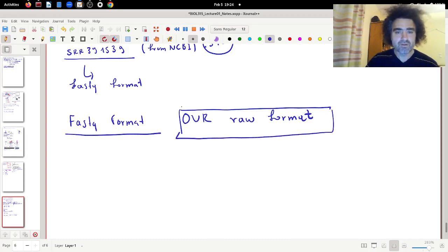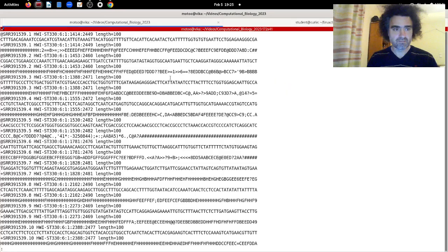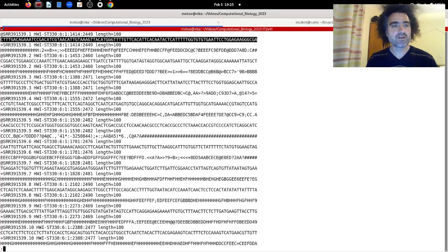Now, if we use NCBI, for example, then we will convert the SRA format to fastq, but I will demonstrate that in another video. It's not actually a proper video for the first lecture. And then again we will go to fastq and we will start our analysis from fastq. Okay, let's now see how fastq looks. Alright, so I opened a fastq file, specifically this SRR file 391539 that we saw before, and here it's the first read that you see.